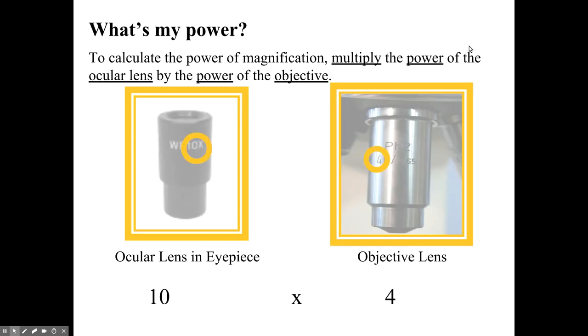The total magnification of what you're viewing is found by multiplying the power of the ocular lens in the eyepiece by the power of the objective lens. So in this case if the ocular lens is 10 and the objective lens is 4, we would do 10 times 4 which gives us 40.